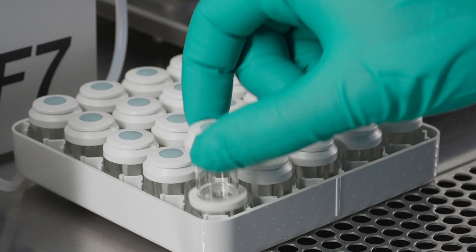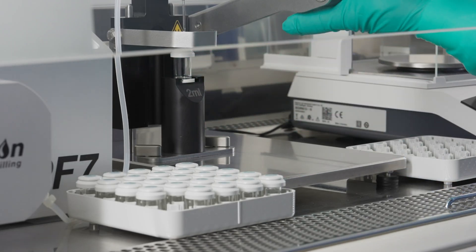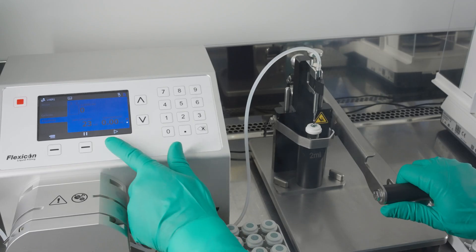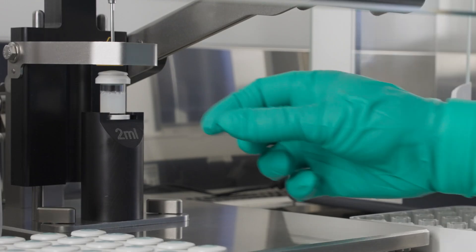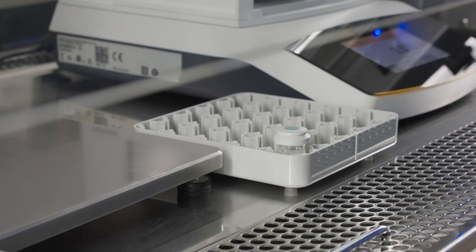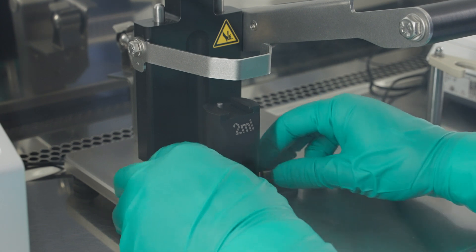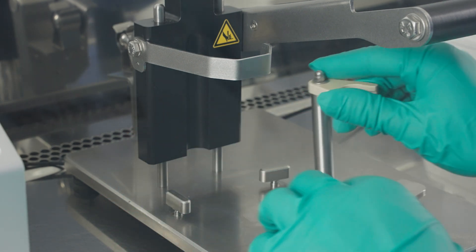For the filling process, one by one, the vials are installed on the base of the filling tool. The product is safely and accurately injected in the vial while being protected from the surrounding environment and contamination. Switching from one vial format to another is easy with the different support bases.